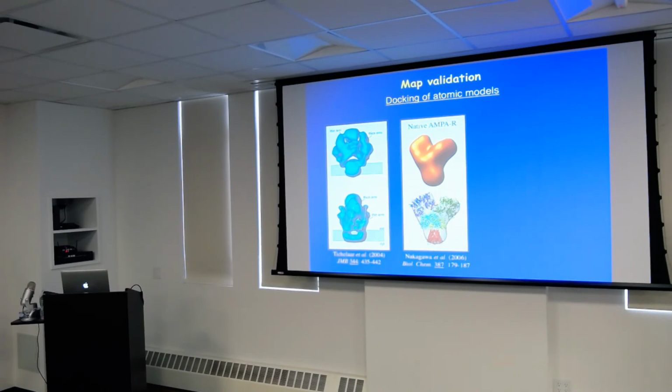If you can do 3D classification and high resolution, then 2D classification is basically not necessary at all anymore. You can even put all the crap particles in there and the 3D classification will take care of it. That's what I've been doing, but Rich thinks that it's still not. We still do 2D classification, but really just to get rid of the bad particles. You cannot use it to get homogeneity into your classes. It just doesn't work.